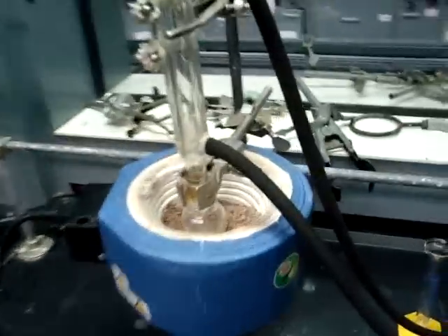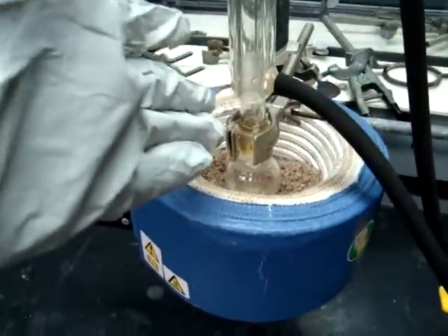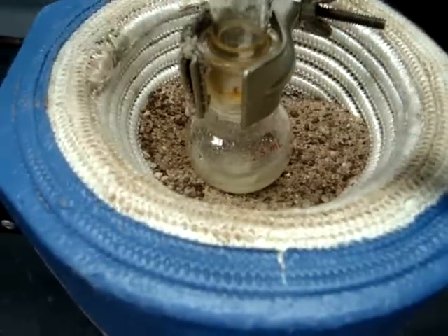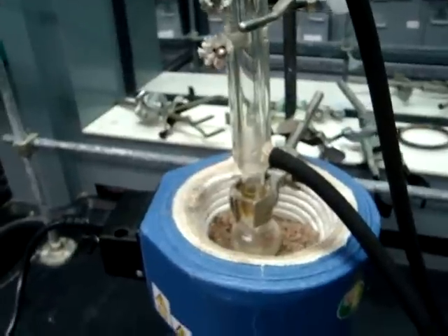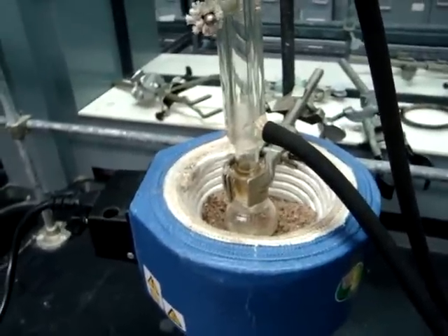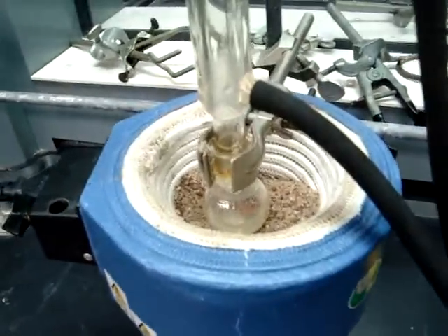In your 25 milliliter round bottom flask, you will have added sodium bromide, DI water, and 1-butanol. Also, with slow, steady swirling, you will have added your sulfuric acid drop-wise to the solution, making sure that you are very careful with the sulfuric acid because it can cause severe burns.